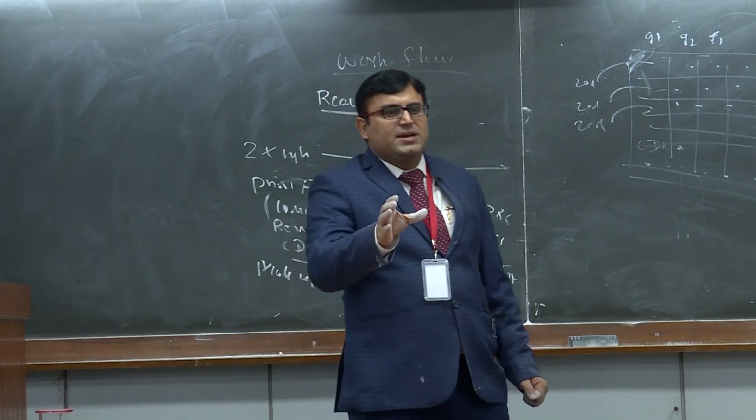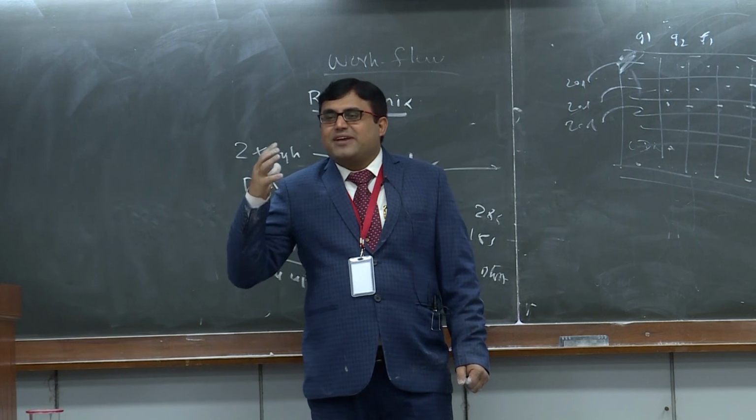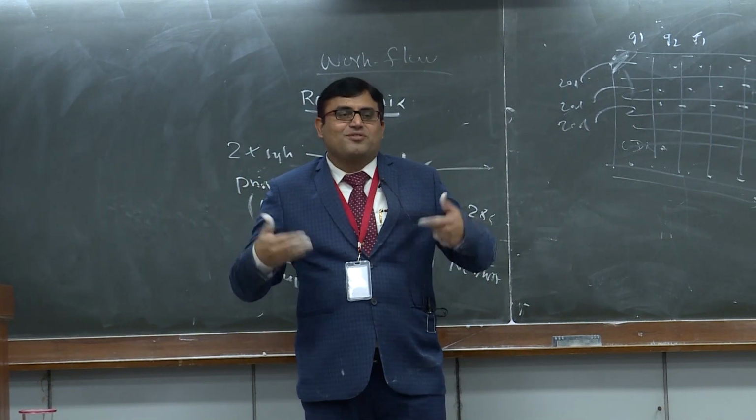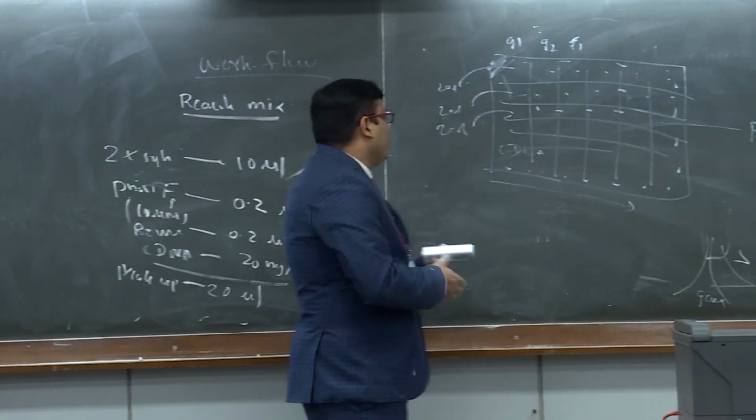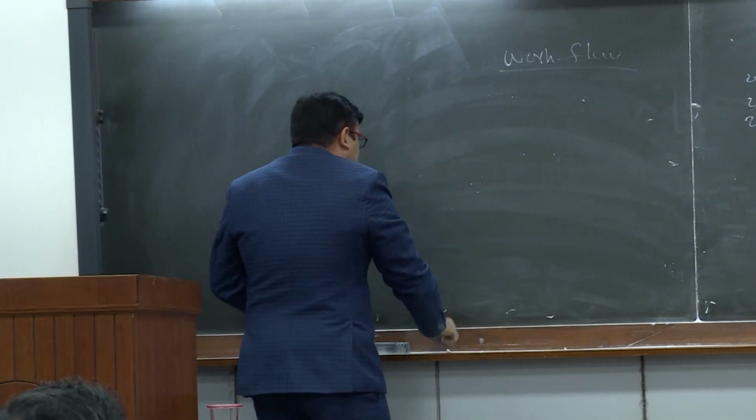So once you feed it inside the instrument, the rest of the part the instrument will do. But the reaction cycle we have to feed from our side. Let's have a look at the reaction cycle.